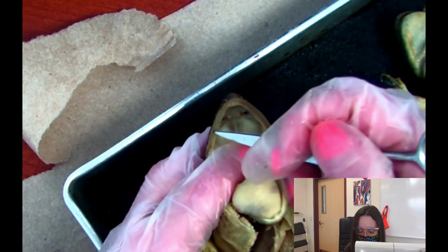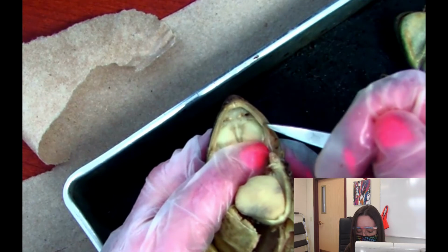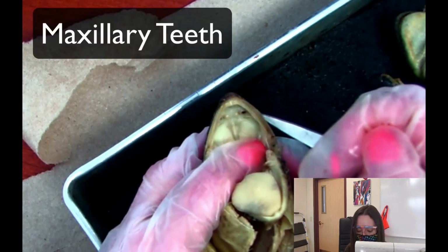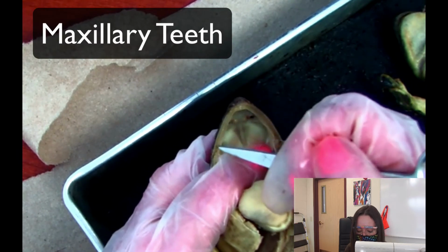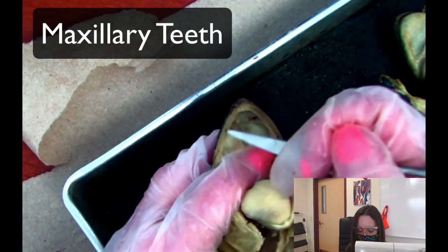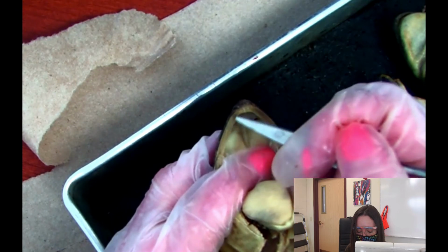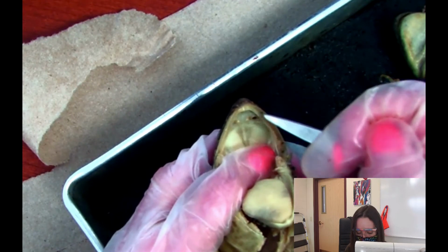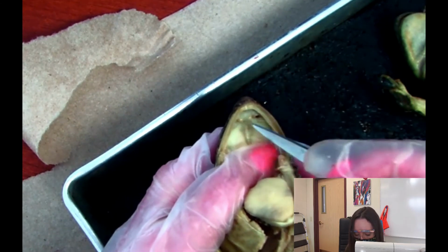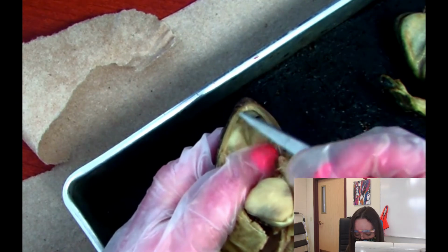There's a sharp outer edge right here. So the sharp outer part, these are actually teeth. There's like teeth here that you can't really see. These are called the maxillary teeth. And both the maxillary teeth and the vomerine teeth just help the frog latch on to the food. Okay, so when we do the quiz, we'll say it's the sharp outer edge of the frog's mouth. And then you'll know it's the maxillary teeth. So we got the vomerine teeth, and then we got the maxillary teeth.